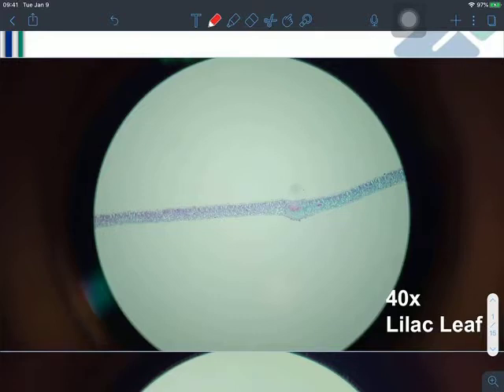You see that there are different colors visible, some blues, some purples, and some pinks. Those different colors are going to correspond to different cell wall biochemistries, meaning that they're made of different things because those are different types of cells. So we're going to be looking at cell coloring to help identify where different internal tissues are.